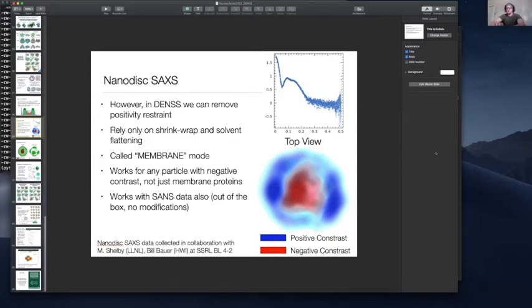All right, that's great news. So 500 nanometers should be no problem. Should be no problem. And that's one of the nice things, and I didn't mention this, but it's an important point: because it's density, dealing with solvent is implicit. Excluded volume is implicit to the nature of contrast, and the hydration shell is implicitly dealt with by the nature of density. That's the major limiting factor for why modeling-based algorithms can't do any size.